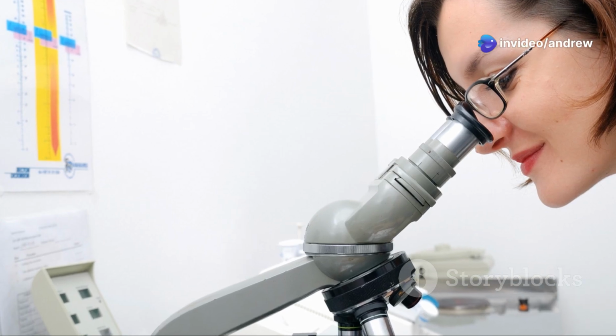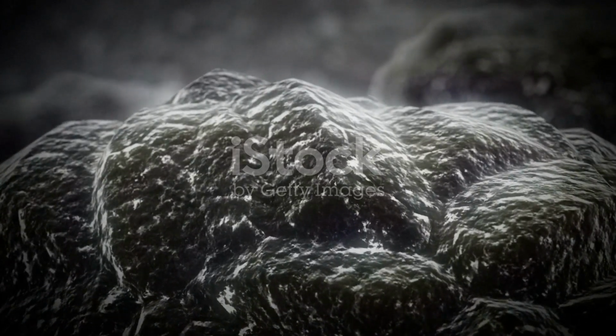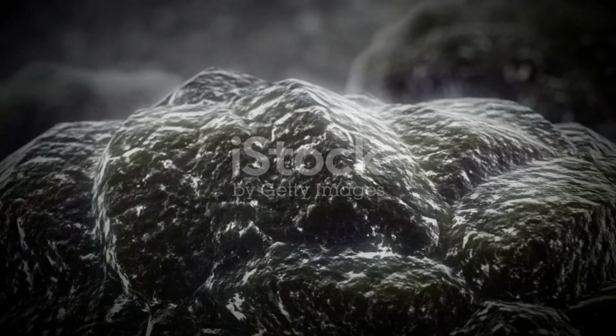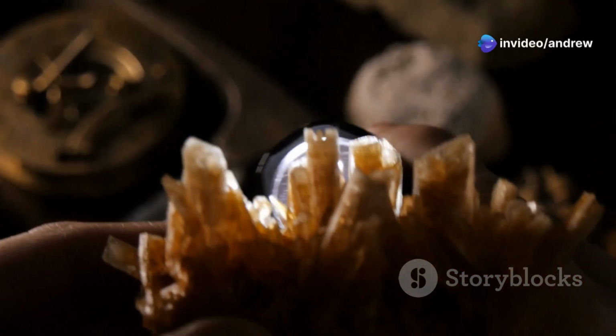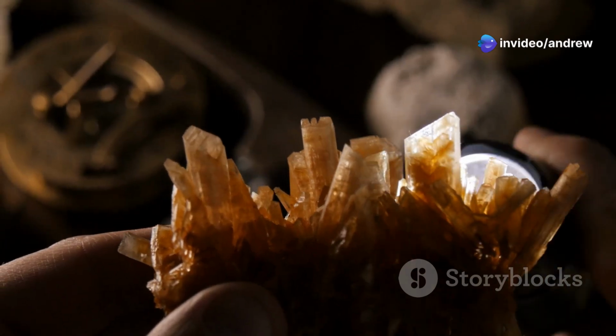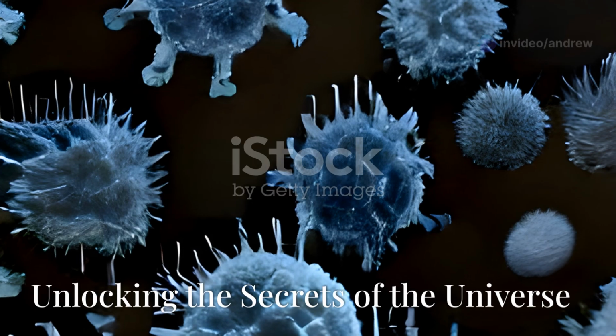Another area of research is the development of in situ electron microscopy. This technique allows scientists to study materials and processes in real time under realistic conditions. In situ electron microscopy is providing new insights into a wide range of phenomena, such as the growth of crystals, the behavior of catalysts, and the function of cells.